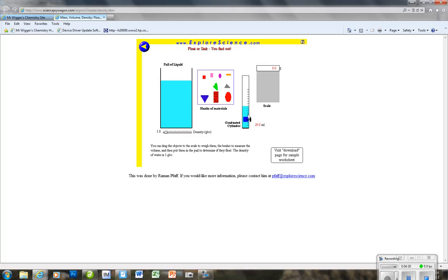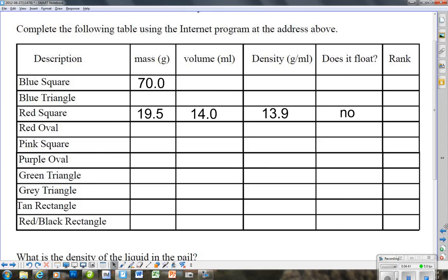There we go, we were right here and now we're up here. The computer kind of tells us what that difference in volume is, so that would be 29.0. Now let's go over here and record it.